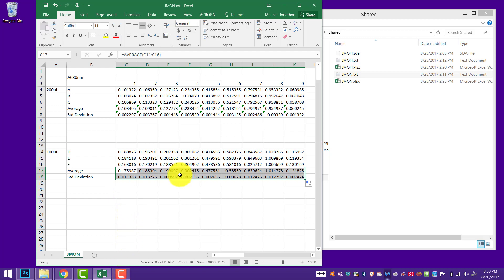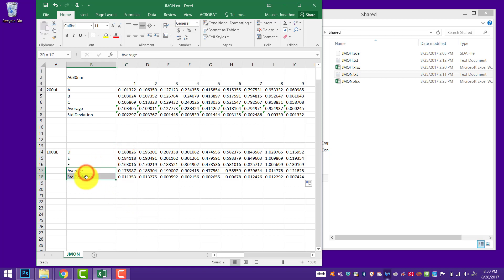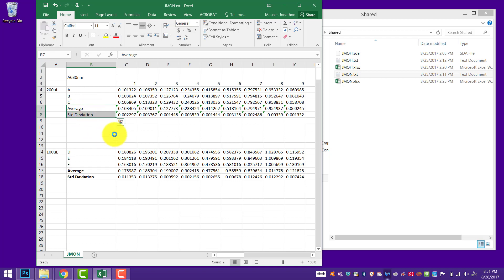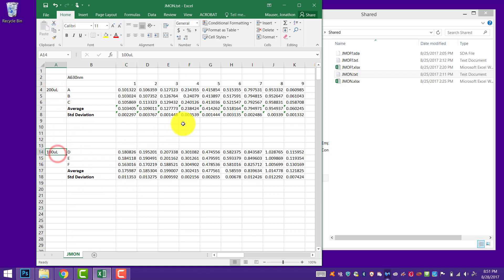So what we have here is our nice average data and the standard deviation of both of those sets — the 200 microliter and the 100 microliter set. I'll do some bolding just so you can see that clearly.